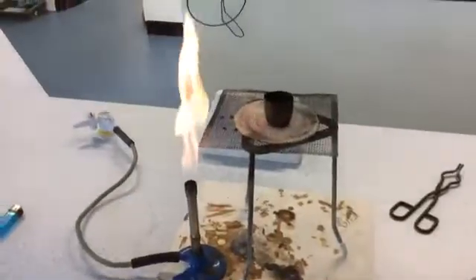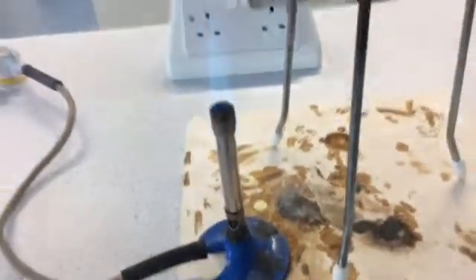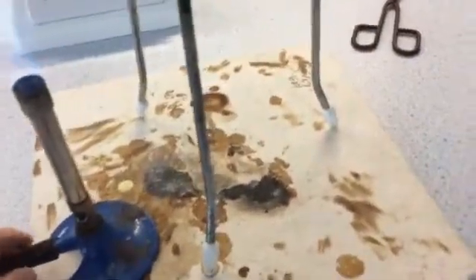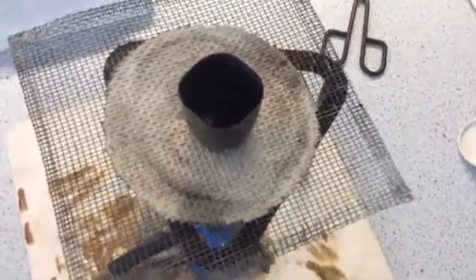So now I have my Bunsen burner on so I'm going to turn it onto the hot flame by opening up the collar to let in as much oxygen as possible. And then I'm going to place it underneath and what will happen is my magnesium will start to heat up and burn.